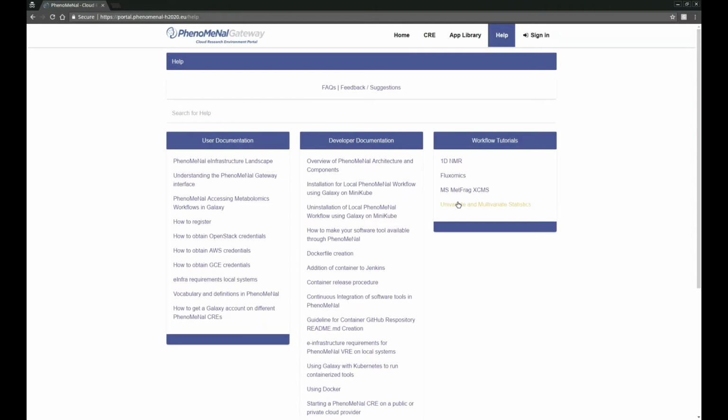any publications about them. Finally, there is a feedback and suggestions link up here, which you can use to message the PhenoMeNal team. Either if you need more information or if you're stuck, you have some problems, you can ask for help, and we'll be happy to give you an answer.